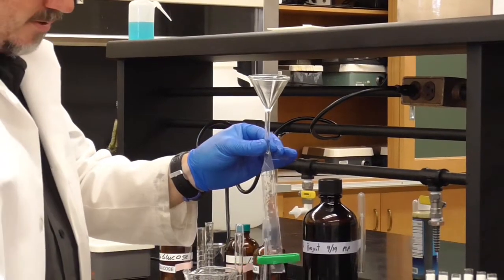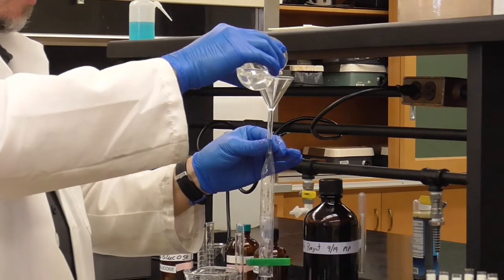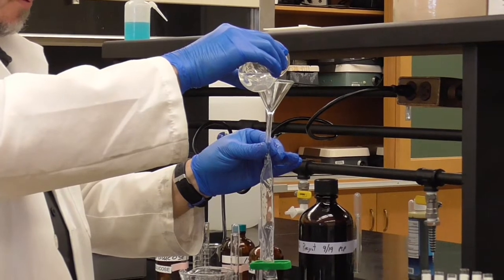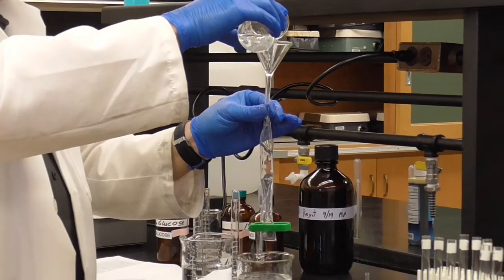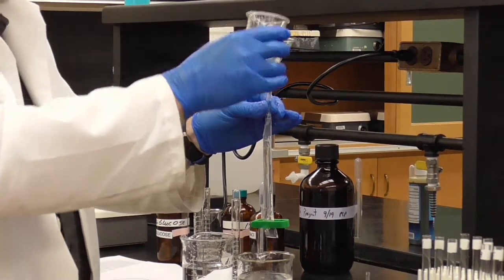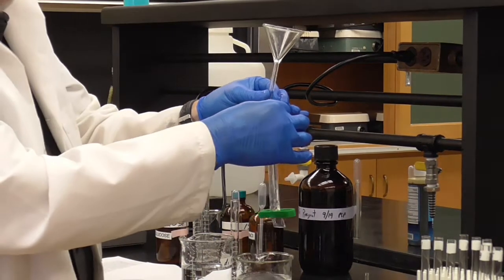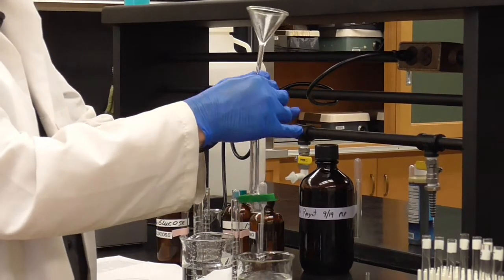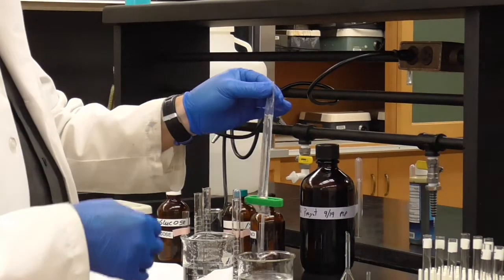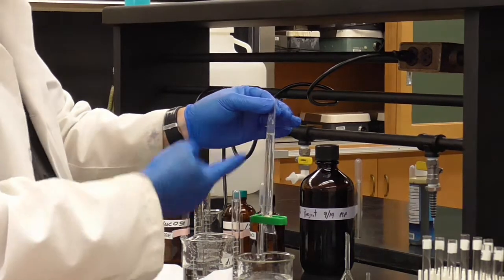All right, and so here's our solution, and very slowly I'll pour that down into the dialysis. You can see it filling up the tubing, hopefully. Okay, looks like that. So now our tube is full of our solution. Of course, we're doing this solution. You could dialyze any solution you want. Body fluids, blood, doesn't matter. You could do it and see what would cross that semi-permeable membrane.